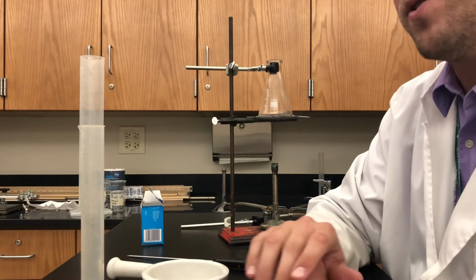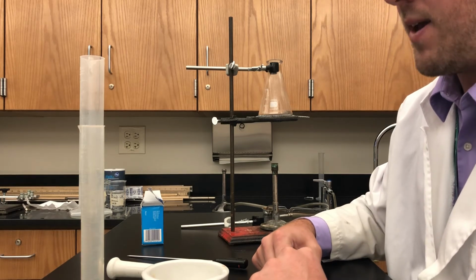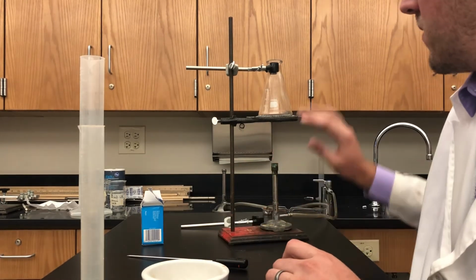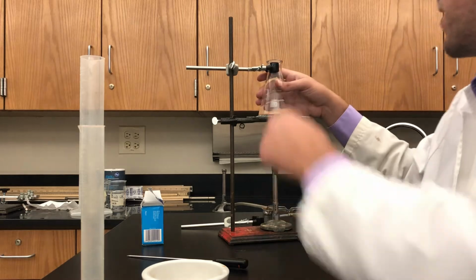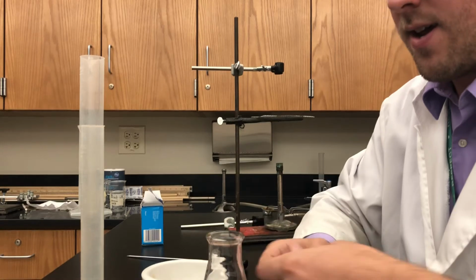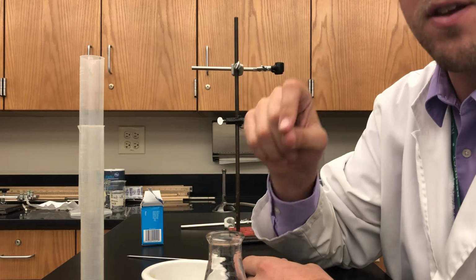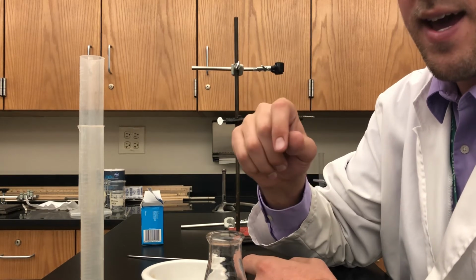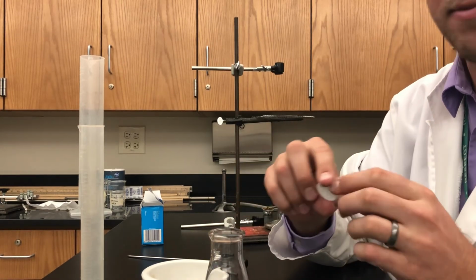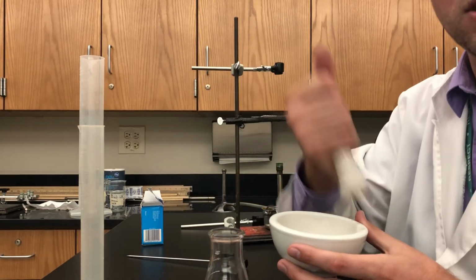That's one experiment. We're doing a totally separate experiment. It's related, but it's really like two experiments in one, because now we've got a new independent variable. For our second experiment, we're not using the heating setup at all. You're just using the Erlenmeyer flask, and you can use that razor, the scalpel kind of thing, the X-Acto knife you might have seen me cutting up the Alka-Seltzer tablets with, and you're going to go from using a full tablet to a tablet in quarters, and then finally you'll use the mortar and pestle to smash it up into a powder.